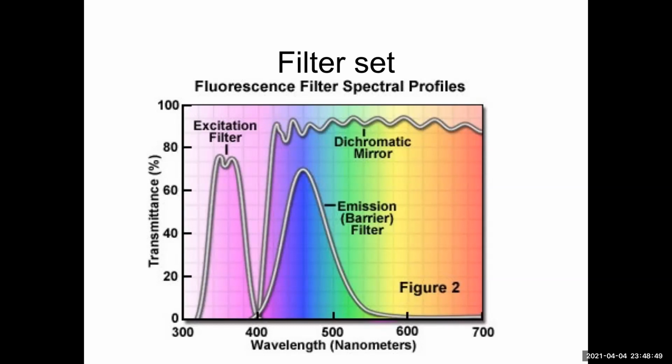And a lot of people, you will even see in published papers, kind of avoid this and just go, it was brighter. Those of us in microscopy who are paying attention are trying to come up with some standards around reporting, because not enough data is reported about scopes currently in research papers.